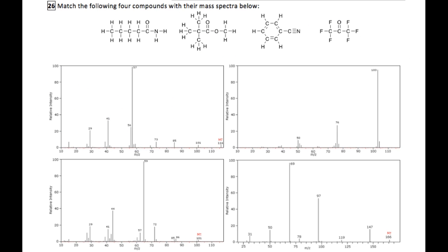So just to introduce the concept, I'm going to play a little matching game where let's pretend we have 4 different organic compounds and we're given the 4 mass spectra that correspond to those, and we just have to figure out which one goes with which. Well, mass spectrometry shows us the molar mass of that compound, as well as some other pieces of information. So before we look at the spectra, let's look at each compound and figure out what the molar mass of those compounds is. Notice that each one in these pictures is made of mostly the same 4 elements.